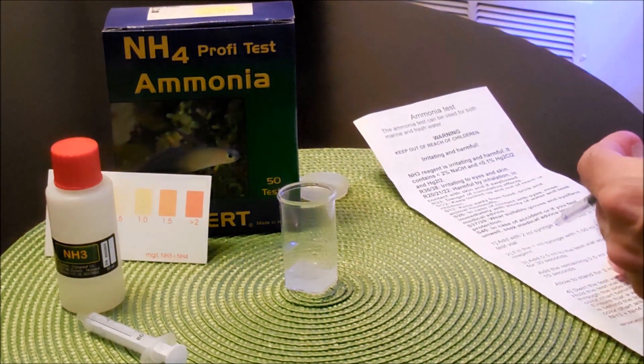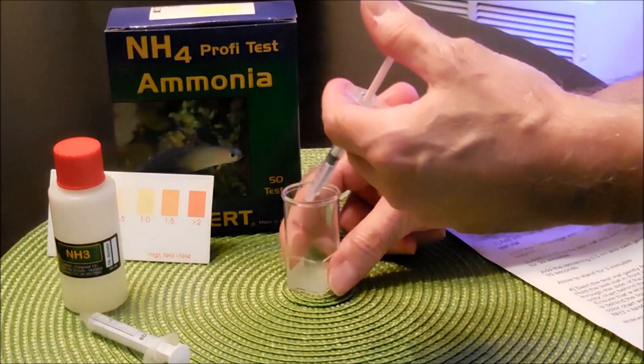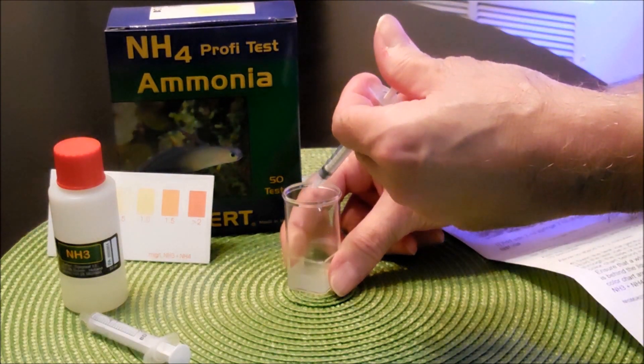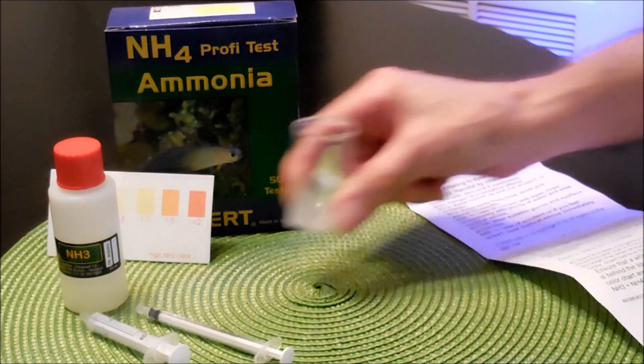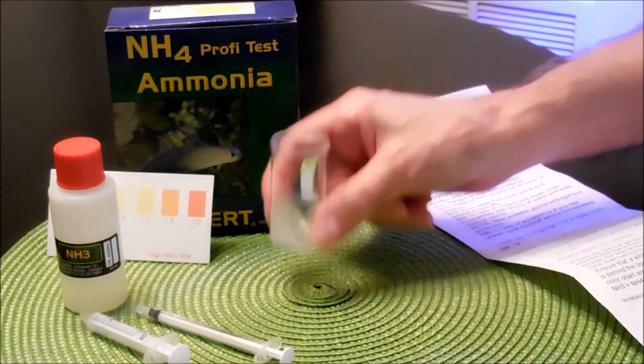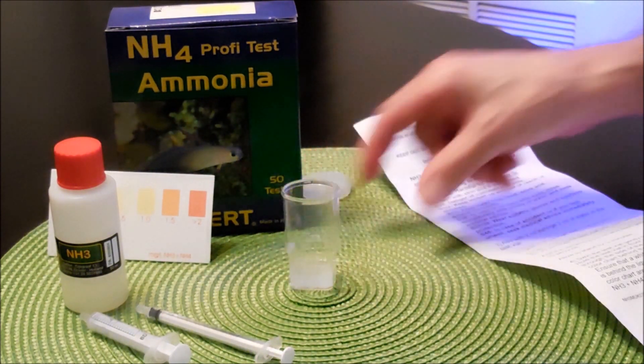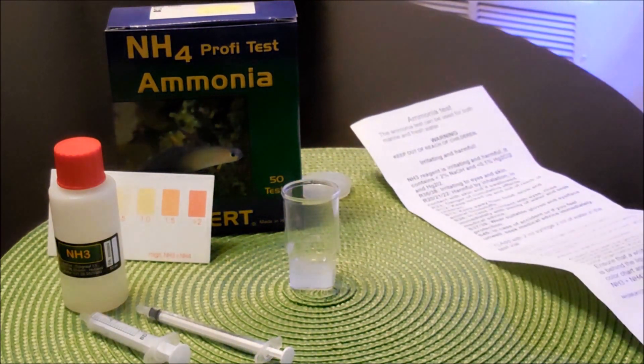And then it says add the remaining 0.5 mL and swirl gently for 10 seconds. There we are. 1, 2, 3, 4, 5, 6, 7, 8, 9, 10. And then it says allow to stand for 3 minutes.